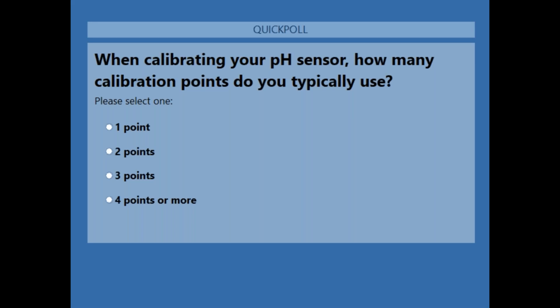Calibration is something that I'm very, very intimately familiar with. I've probably switched out and calibrated hundreds of pH probes, probably broken quite a few too. One good tip is a broken probe will not calibrate, but we will cover that, believe it or not.